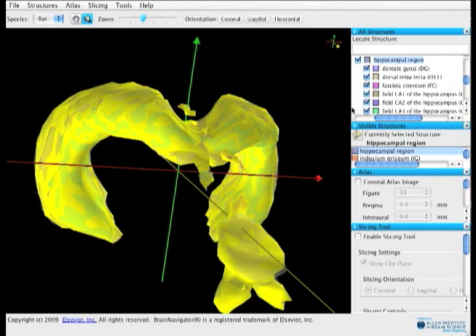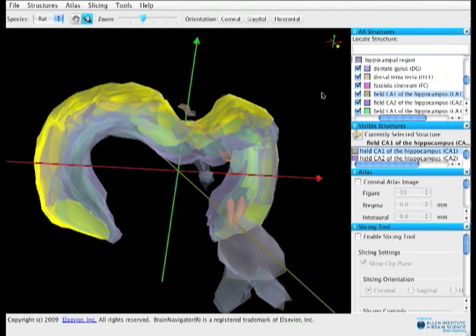Conversely, you can click a structure name in the ontology list and it highlights yellow in the 3D brain maps so you can find it immediately.